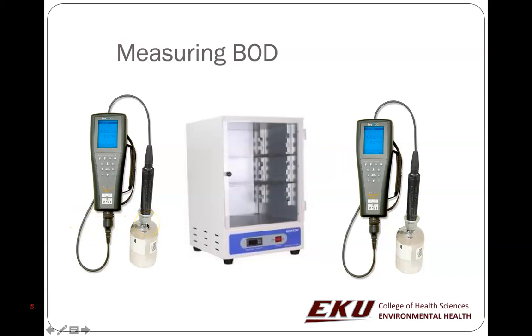There are a variety of different types out there. There are even instruments that automate all this. So you measure your initial dissolved oxygen in each of your samples, including your negative control. You incubate for 5 days, and then you measure after the 5 days.